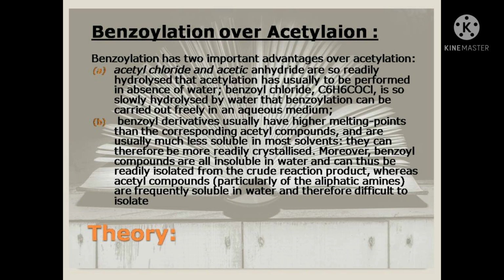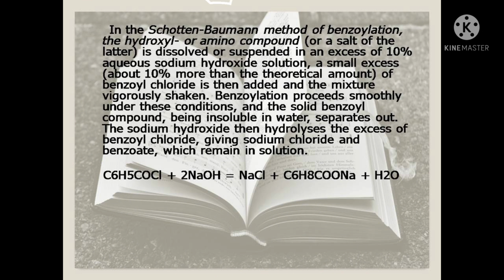Benzoyl derivatives usually have higher melting points than the corresponding acetyl compounds and are usually much less soluble in most solvents. They can therefore be more readily crystallized. Moreover, benzoyl compounds are all insoluble in water and thus can be readily isolated from the crude reaction product, whereas acetyl compounds, particularly of the aliphatic amines, are frequently soluble in water and therefore difficult to isolate.